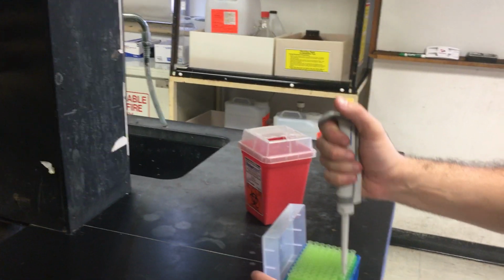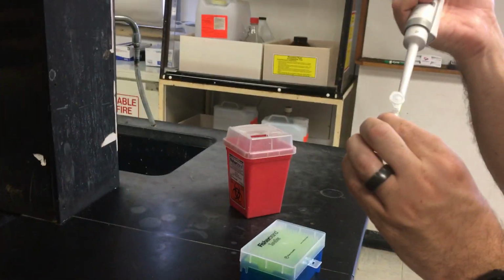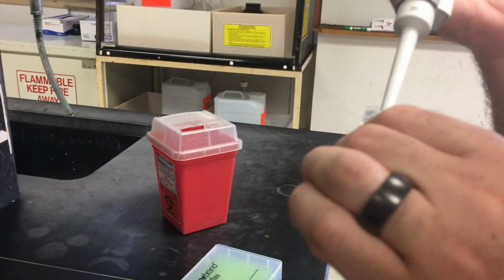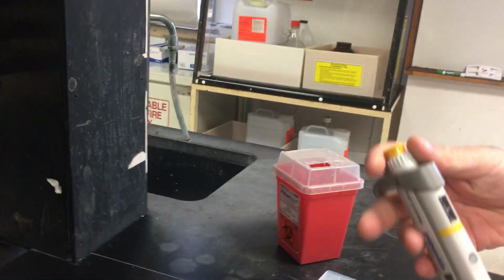Next, we're going to add our 10x buffer 3. And remember, we are working with restriction enzymes, but they are enzymes, so they have a preference of pH and conditions that they would like. We will see these 2 enzymes like to be incubated at 37 degrees, but there are other enzymes that like different temperatures. And finally we will add.